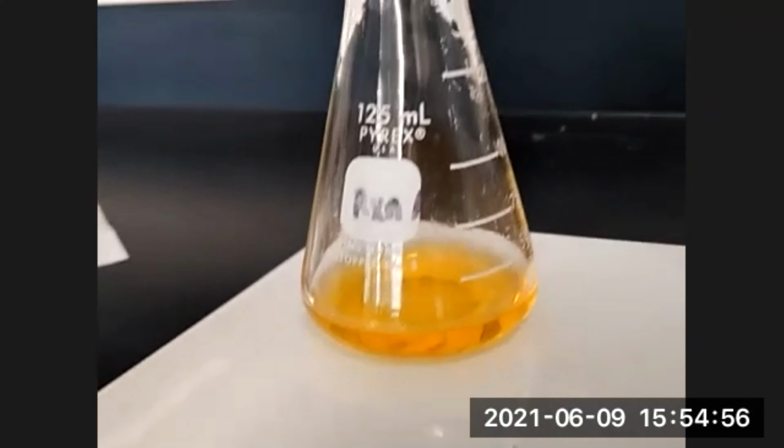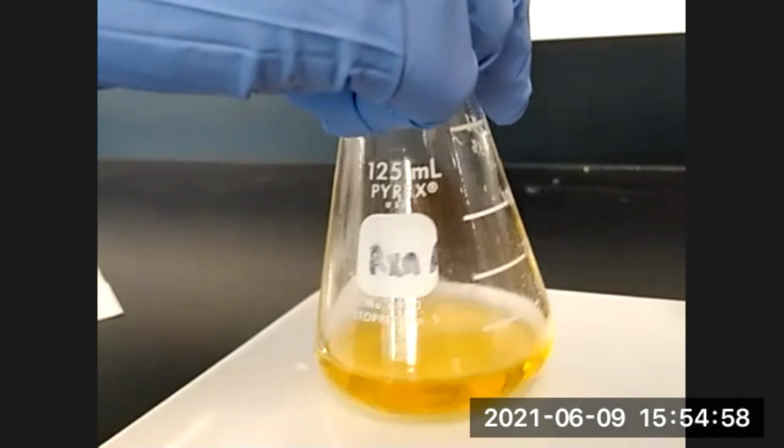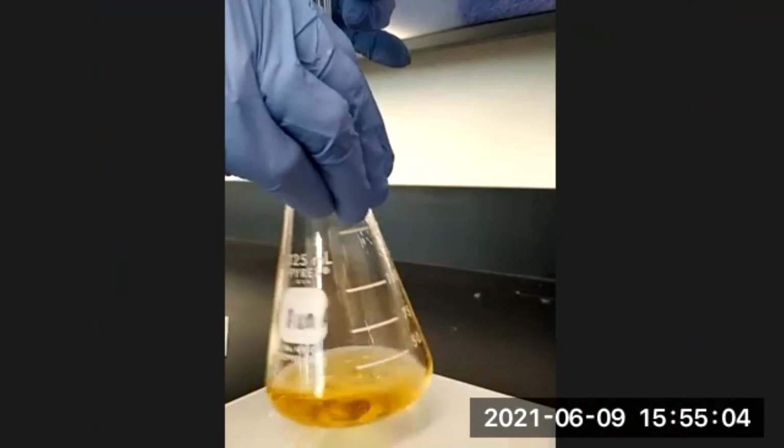Now we're going to see how much HCl is needed. So we're starting at 0.4 milliliters. We're going to see how much hydrochloric acid is needed to change the color of the solution. So when the solution changes color, that's the end point, which also correlates to the equivalence point of the acid-base reaction.